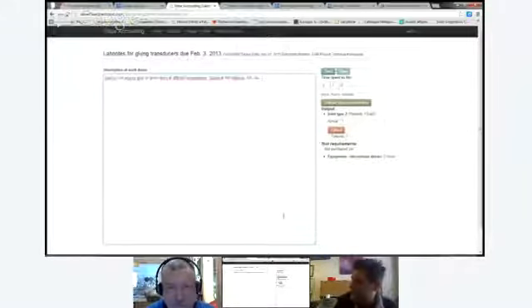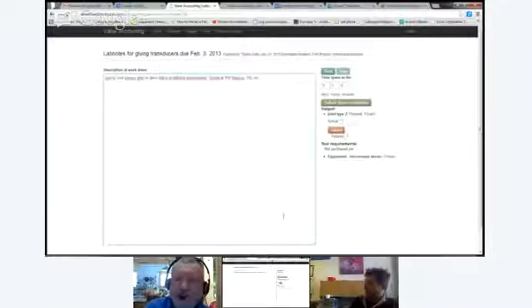So Francois' question, I think, was if I put text only there, will I lose it? No, you will not lose it. It will be out there. Now there is a minor problem in that we're not using an industrial strength database. Now the database, it's a good database.